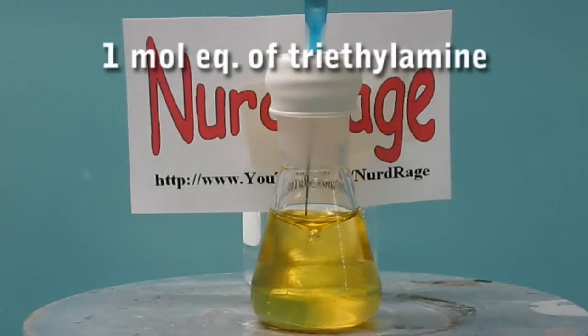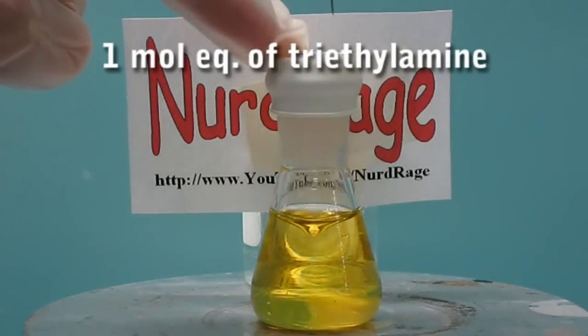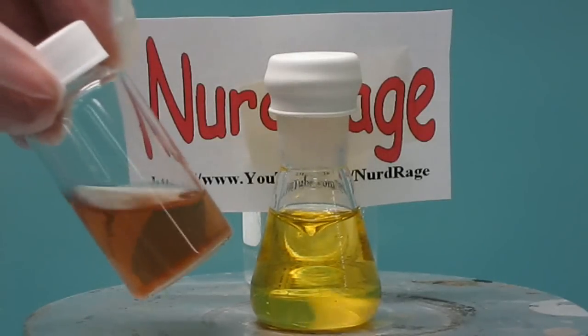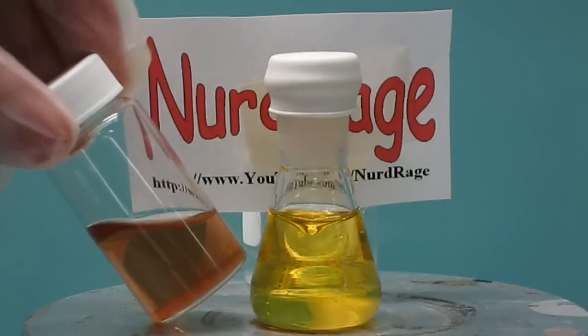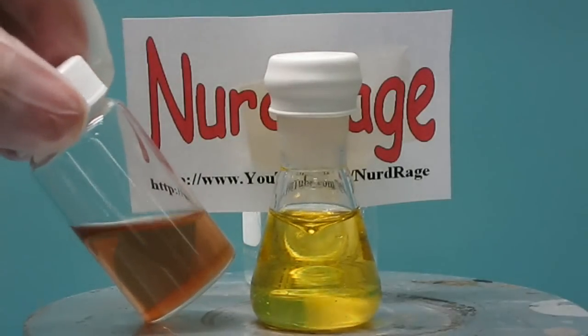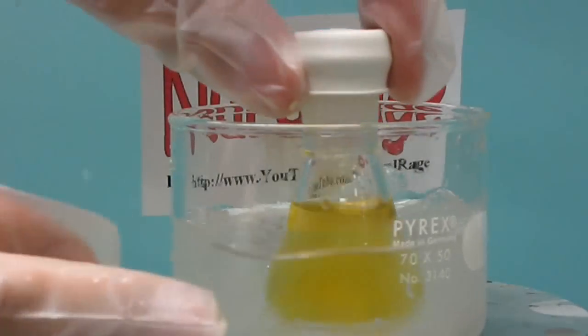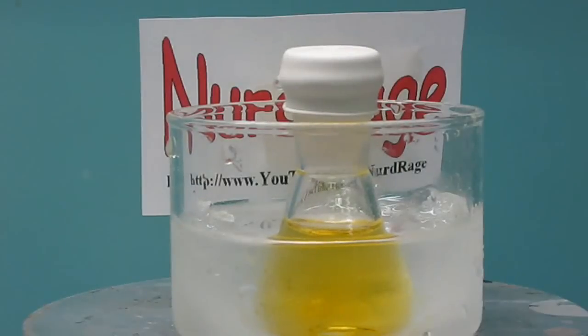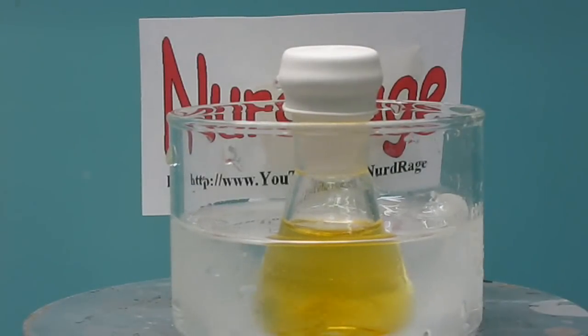If this trichlorophenol were perfectly pure, it wouldn't change color, but mine isn't. Some batches of trichlorophenol will even change to a reddish color. In any case, this is not a problem for this reaction and you shouldn't be alarmed if it occurs. Now place the flask into an ice bath and give it 5 minutes or so to cool down. If you're doing this on a larger scale, you should give it more time.